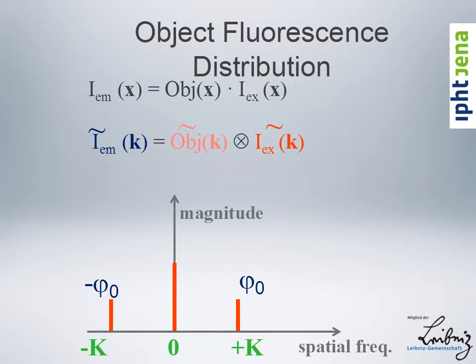And since we can phase shift that pattern, moving it left and right, I wrote here in a very crude way, I just wrote down the phase phi 0. So what this really means is e to the i kx plus i phi 0, if you want, and minus i phi 0 here. So that means when we shift that pattern, this one sort of rotates in one way in complex plane, and this rotates in the other way.